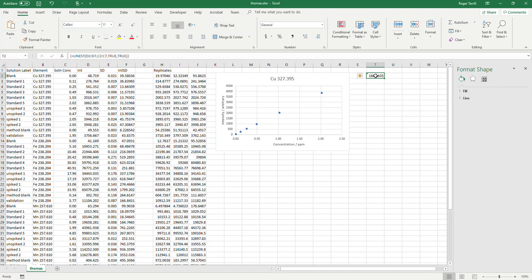Now I did that a little bit prematurely, but I'm going to fix it here. So 1, 2, 3, 4, 5 by 2, right? I highlight that. Now I come up into the formula bar. And now everything's highlighted, and I'm going to go Shift, Control, Enter. There we go. There's the LINEST. This is slope. This is intercept here.